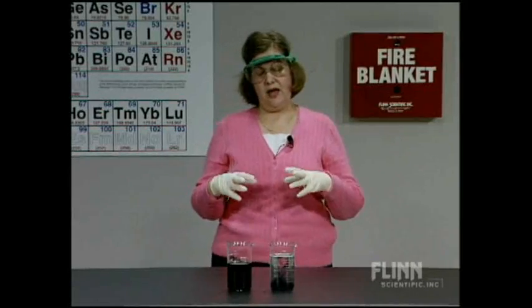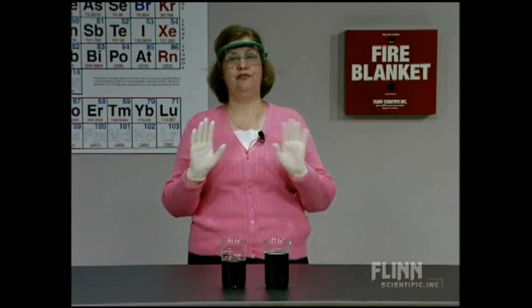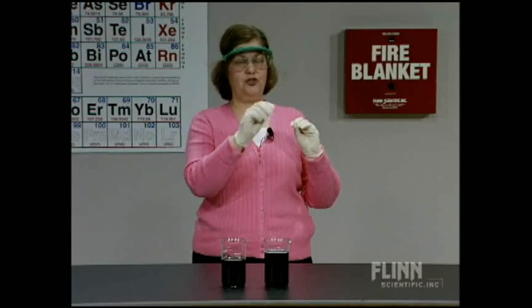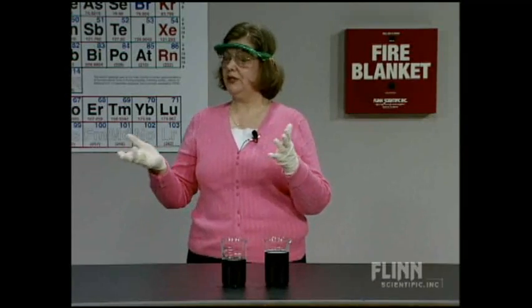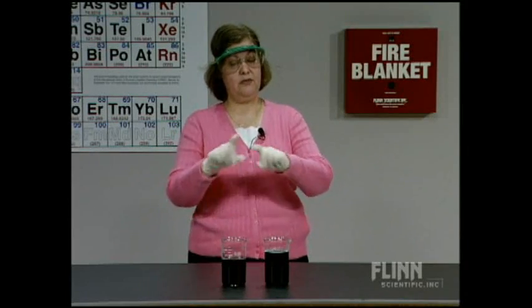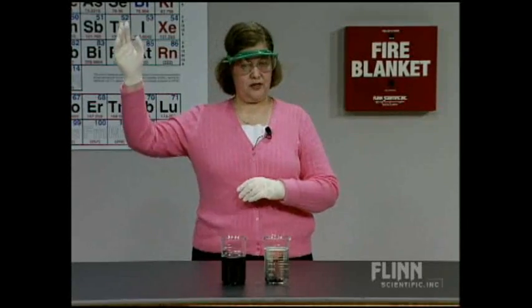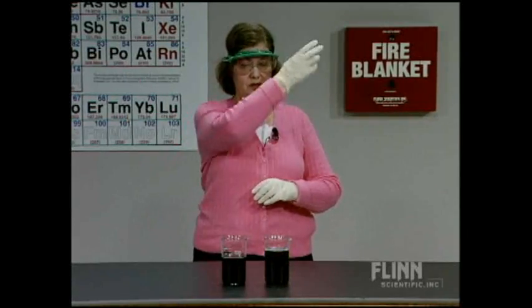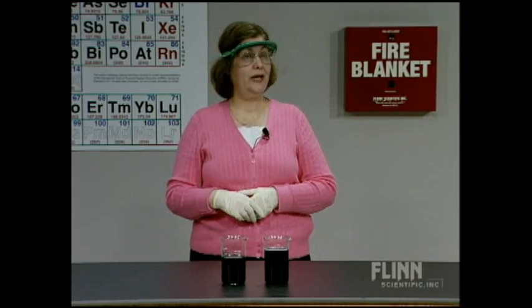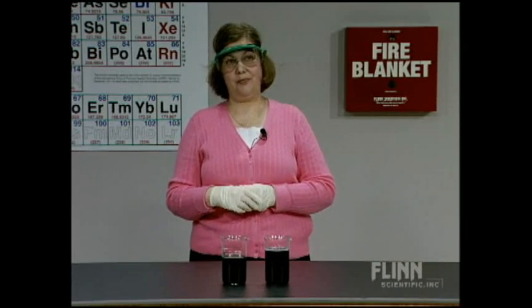The one interesting thing otherwise about an oscillating chemical reaction is that the only time you see this is if you are far away from equilibrium. One of the downsides is you teach equilibrium, and students say, well, eventually every reaction is going to reach a position of equilibrium. Not so. If your concentrations are so far away from equilibrium, then this is what can ensue if there are two pathways. You get an oscillating chemical reaction. That pendulum is swinging from one way to the other, and that cycle will repeat itself. So the yellow-blue switcheroo, an example of an oscillating chemical reaction. As I said, I think it proves that chemistry still has the power to surprise.